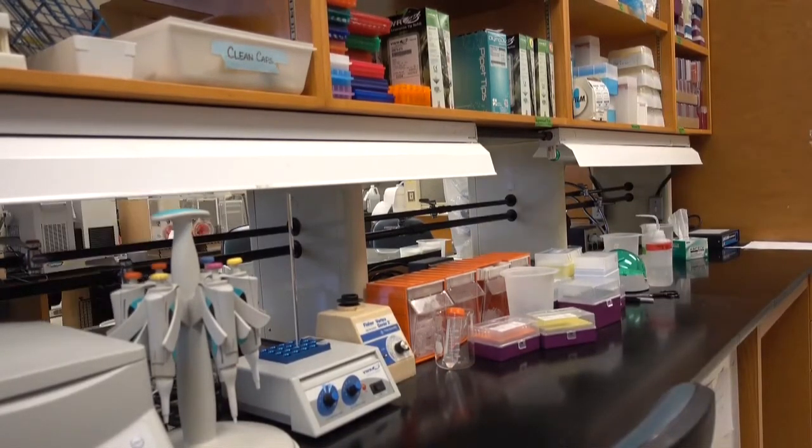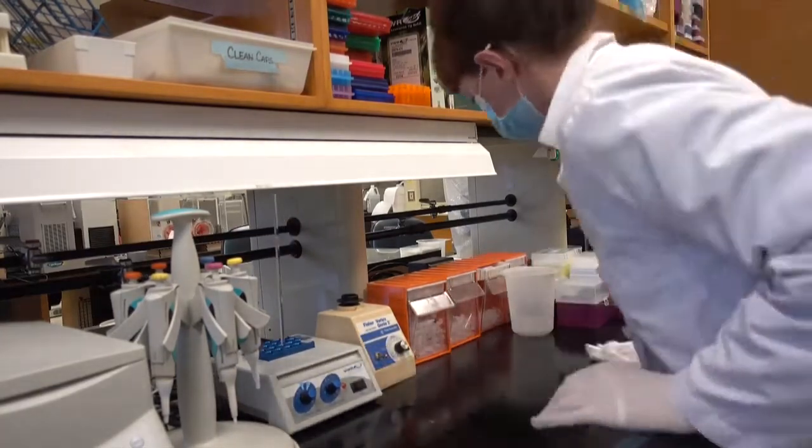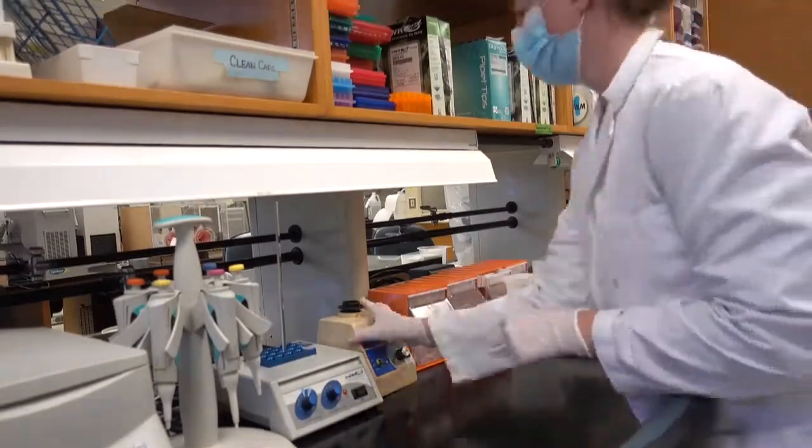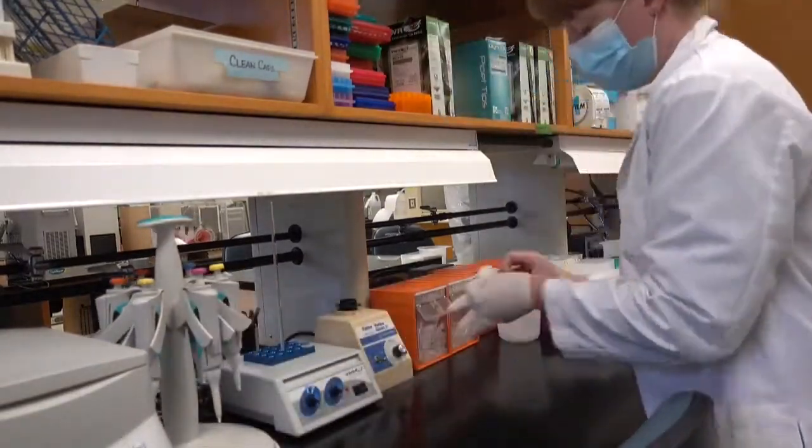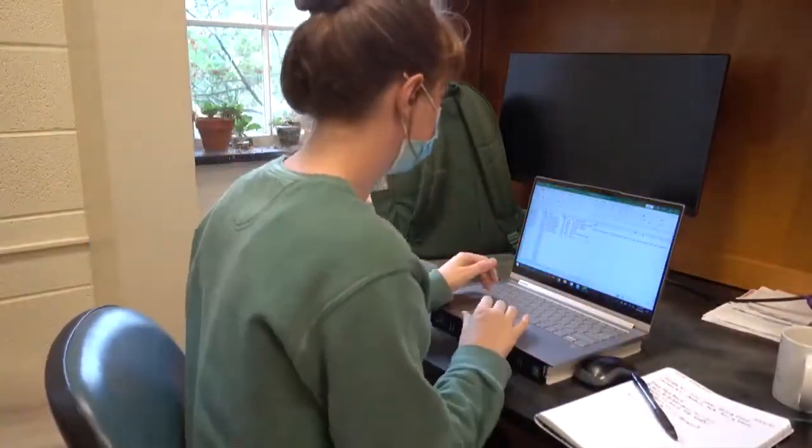And then of course, once I'm done with the DNA extraction, I need to tidy up by putting everything away and wiping down my lab bench. And now I'm just recording all those DNA concentrations from my lab notebook into a spreadsheet.